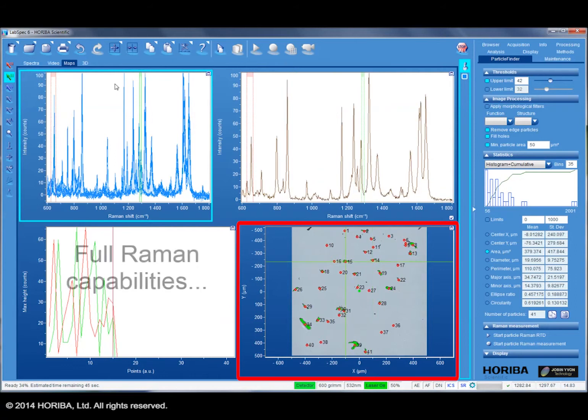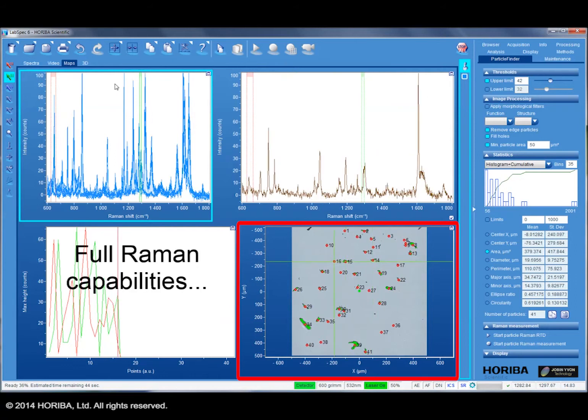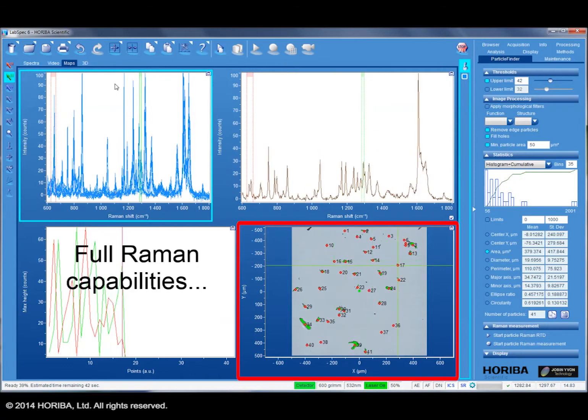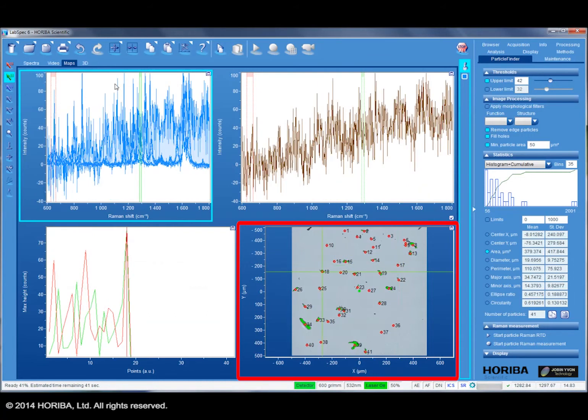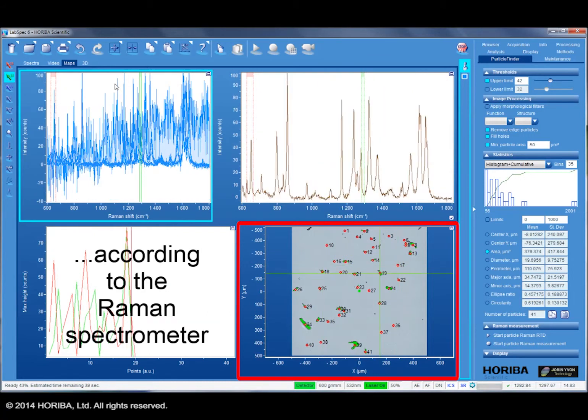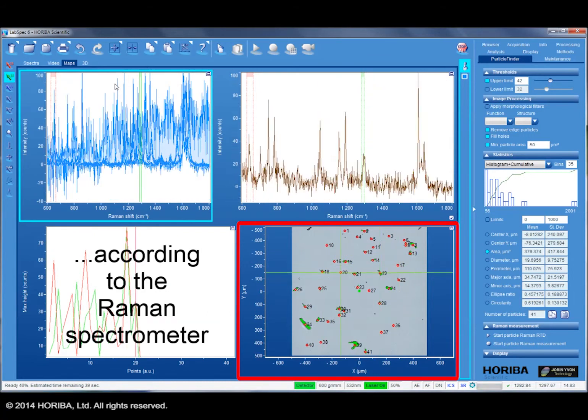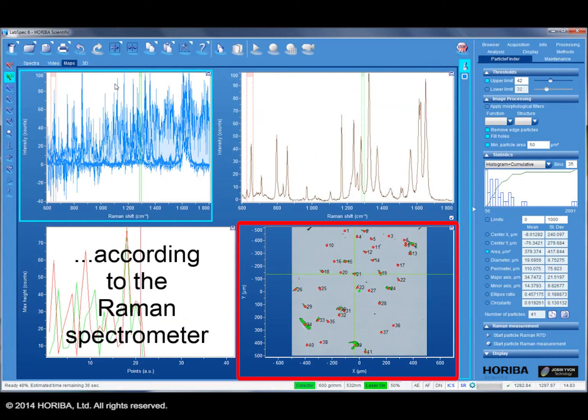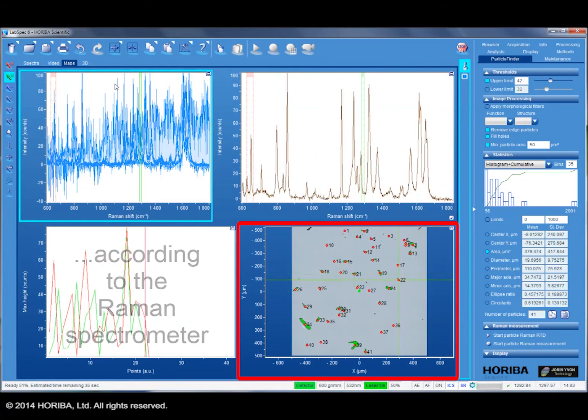The measurement conditions can exploit the full capabilities of the Raman instrument, whether it be the small Analytical Explorer system or a well-configured LabRAM HR Evolution with multiple lasers and detectors.